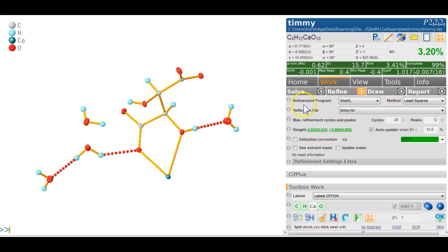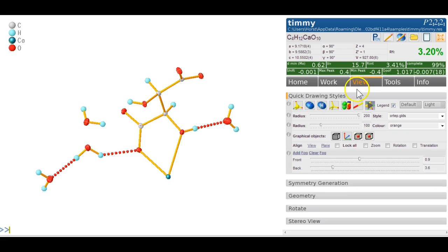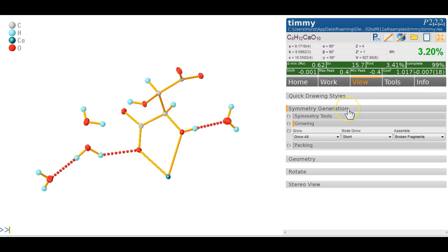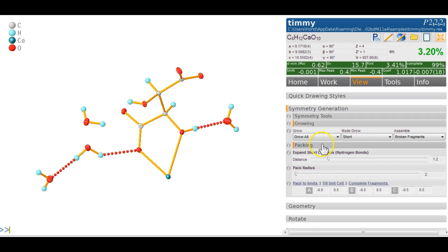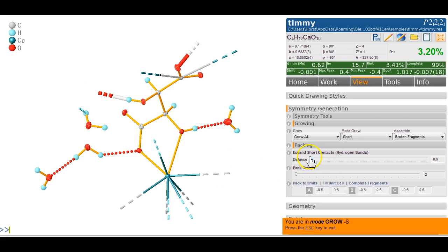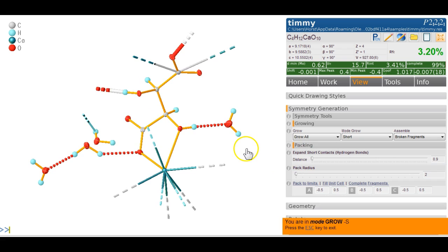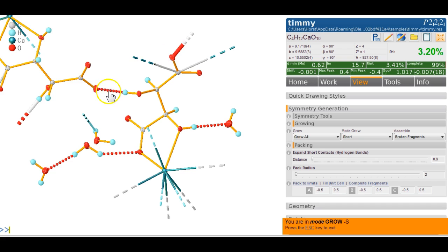If I go back to fuse, there's another tool in view and symmetry generation where we can look at the growing. Packing is what I want. We can expand short contacts—the hydrogen bonds. Using that slider carefully, we can see the first and shortest hydrogen bond. We can click on this and this will generate that bond on this side and that bond on that side.